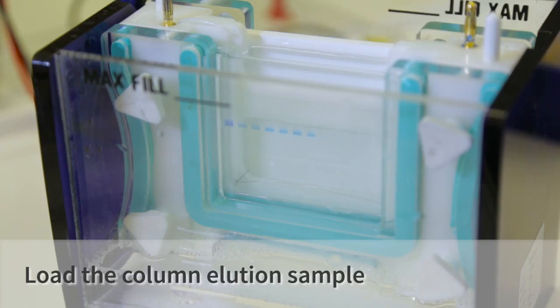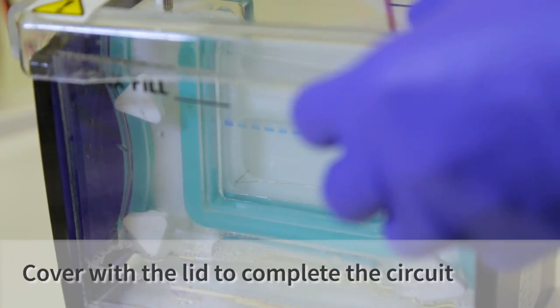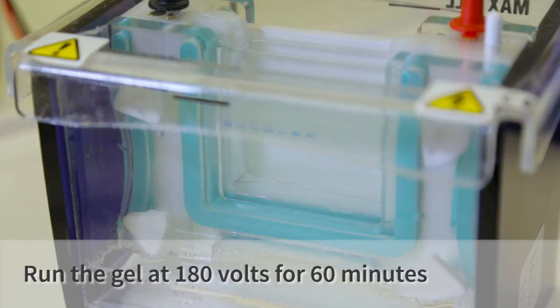Now the final sample is our elution. So this will be when we added the imidazole and eluted our protein. So hopefully only our protein should be present. Now all our samples are loaded, put the lid on the tank, and set it to run 180 volts for 60 minutes.